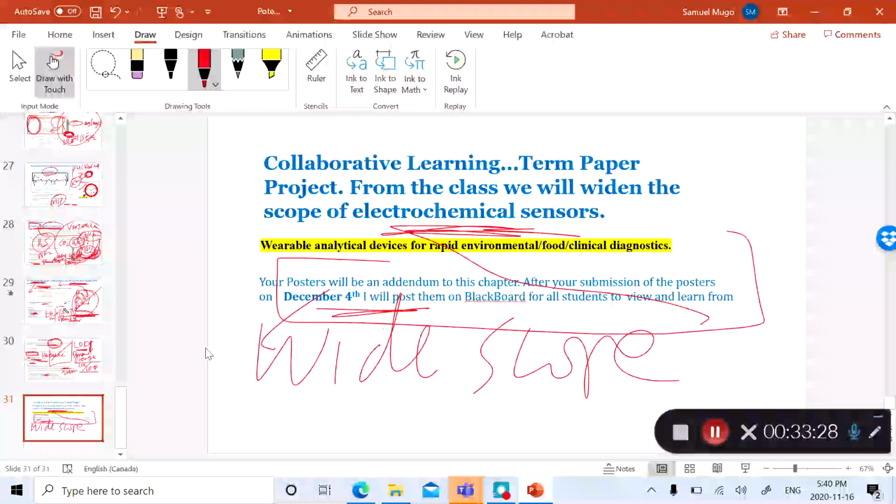And so that's all that I'm going to say, really, about potentiometry. It's a very wide topic, or electrochemical sensors in general. But I hope, from what I have summarized, you've gotten bits and pieces of the scope and the bird's eye view of the application of this important technique, especially in our day for wearable devices.